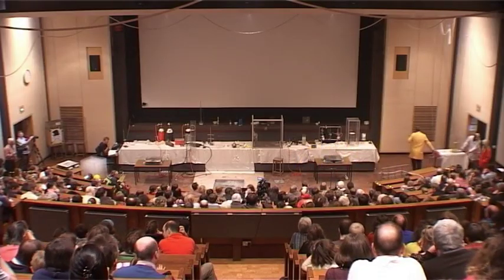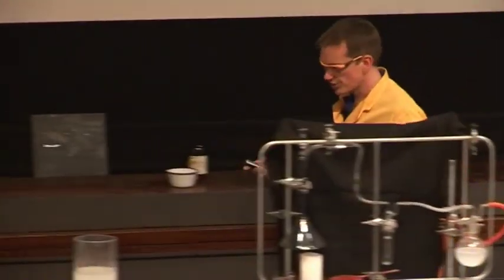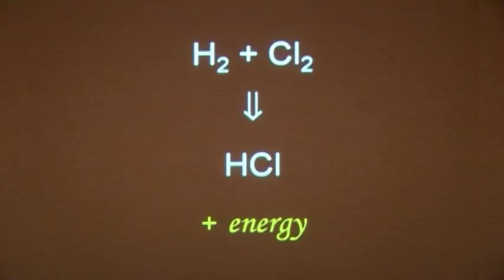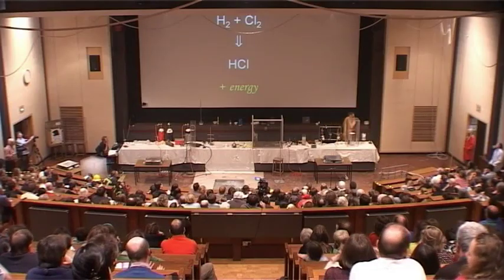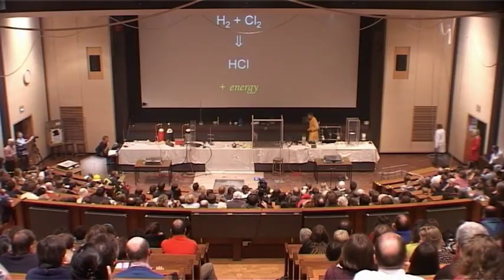Okay, good. So the hydrogen burnt in the chlorine, so no oxygen there at all, and the reaction that we saw is hydrogen combining with chlorine. No bang, it was just burning very nicely. Can we get a bang here? Well, we can get a bang if we mix them in just the right ratio.